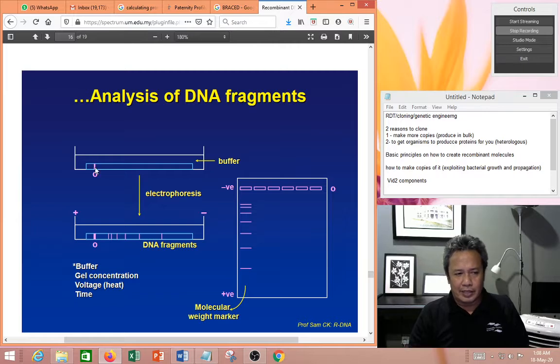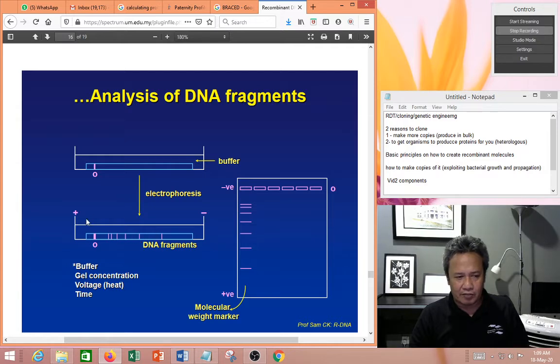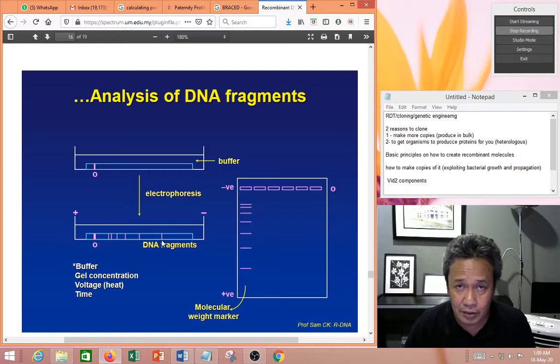So you put your DNA sample in what's called a well, right? Then you switch on electricity, your current will flow through, and your DNA will be separated based on fragment size. From this, you will see that the fastest moving fragment must be the smallest, followed by the larger fragments and so on.